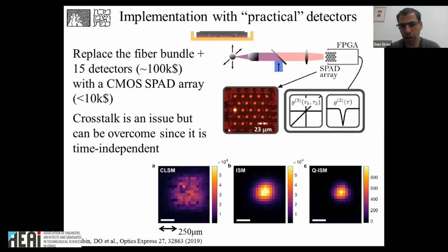So when you image this, you see hot pixels or hot detectors which have more dark counts. The reason you actually see this is because an avalanche photodiode emits light when it fires. So it emits light whenever there's an avalanche, and even if there's no photon, if it's a dark count, it emits light. Generally speaking, today, these CMOS compatible APD arrays give quite uniform responses.